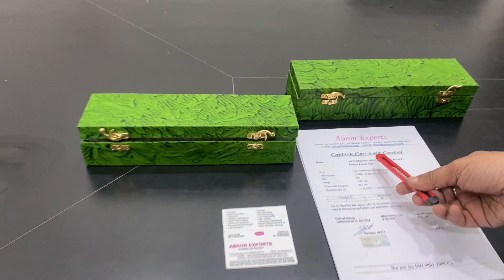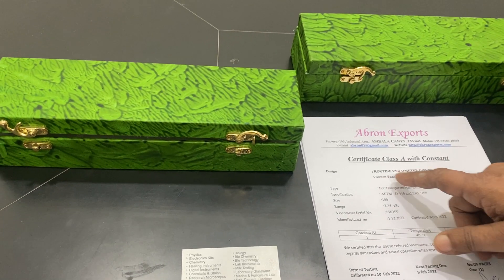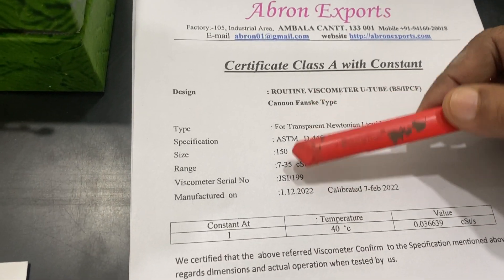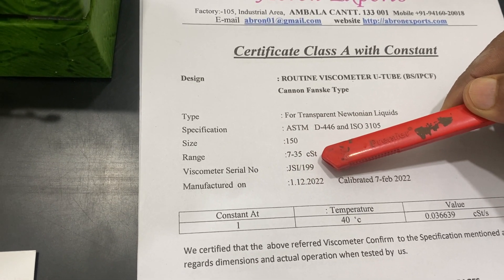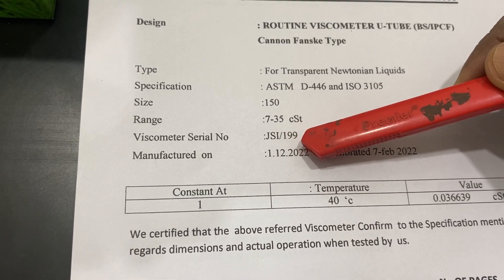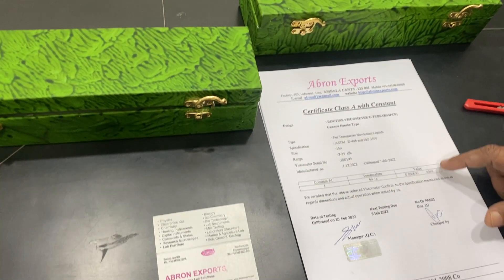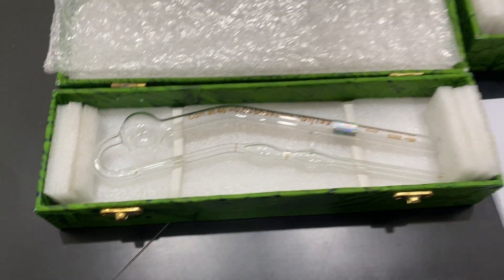This is a calibration certificate for the Canon Fenske type viscometer, model size 150mm, with a range of 7-35 CST. It comes with the serial number GS199, and we have two of these models. This calibration certificate is valid for one year and comes with the packing.